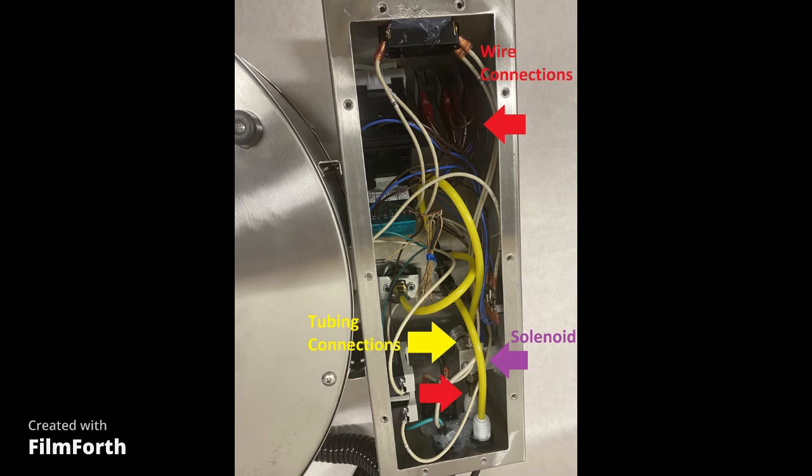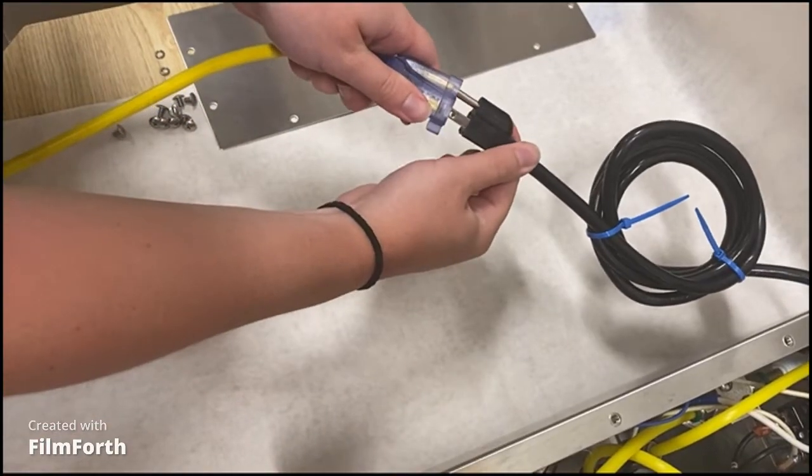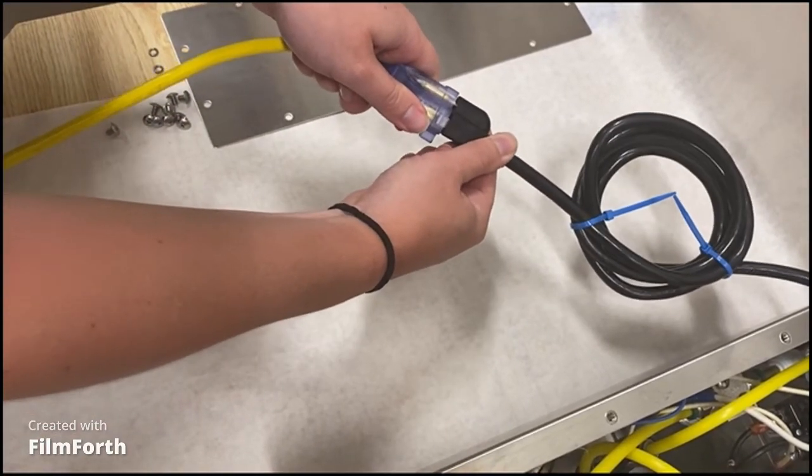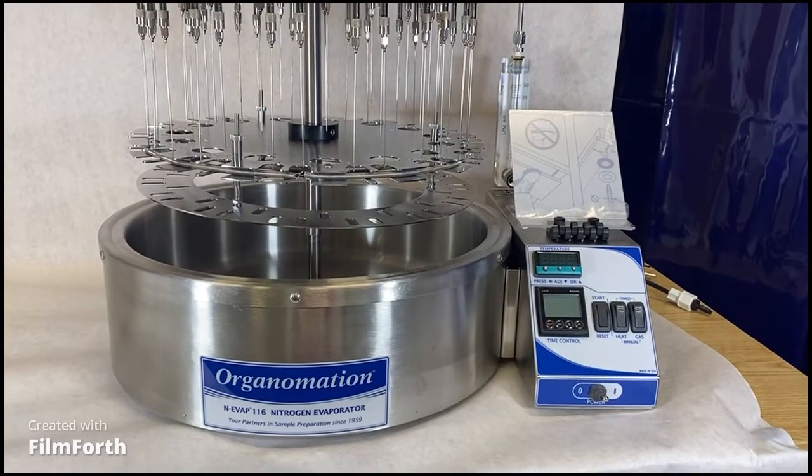To check this, keep the control box open and upside down. Make sure the gas switch is turned to manual and the power switch is turned on. Be very careful not to shock yourself. Plug in your instrument and listen for a click coming from the solenoid. If you do not hear a click as the solenoid is energized, then it is bad and needs to be replaced.